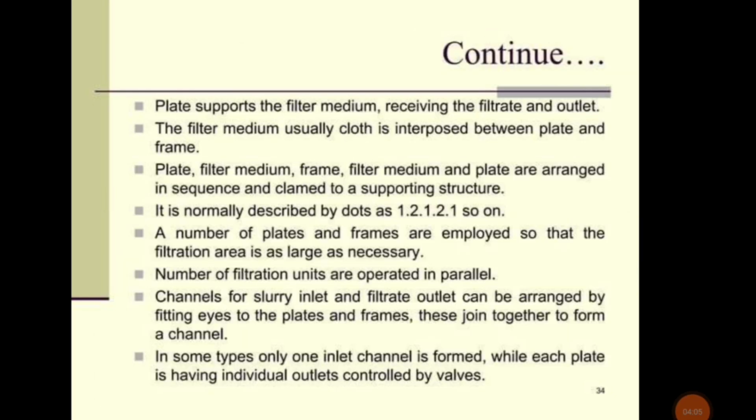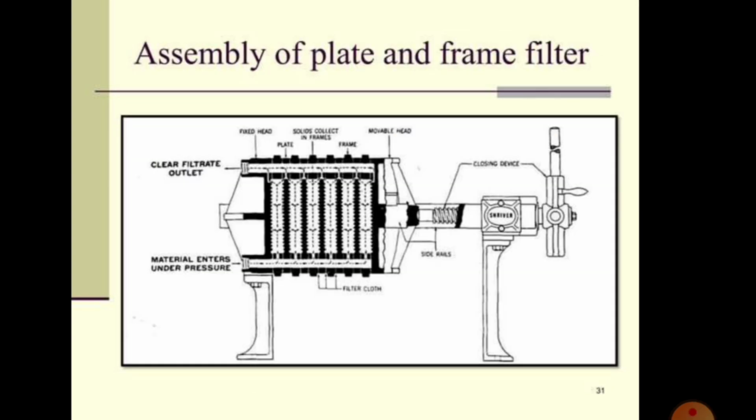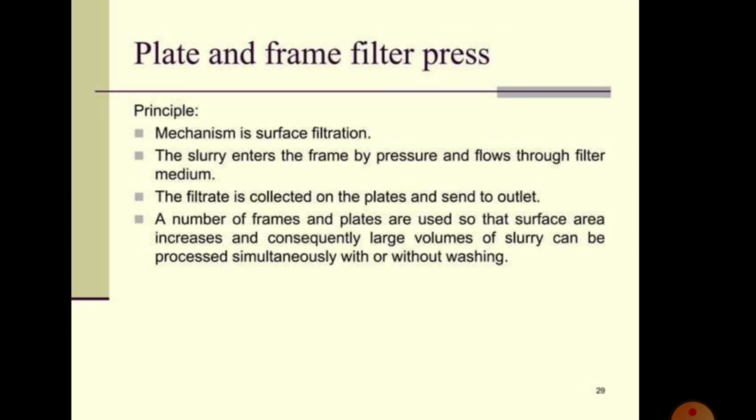In today's class, I discussed the following: construction, assembly, plate and frame filter, and their diagram.